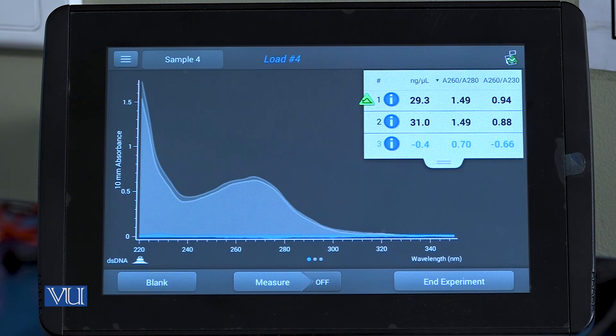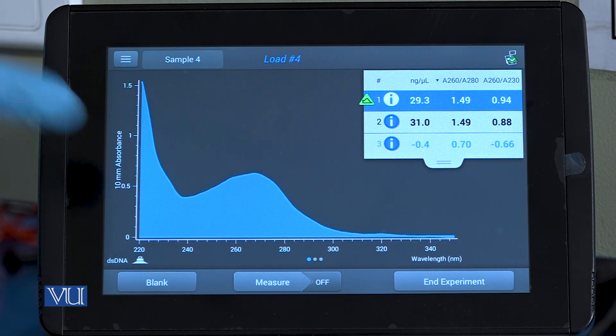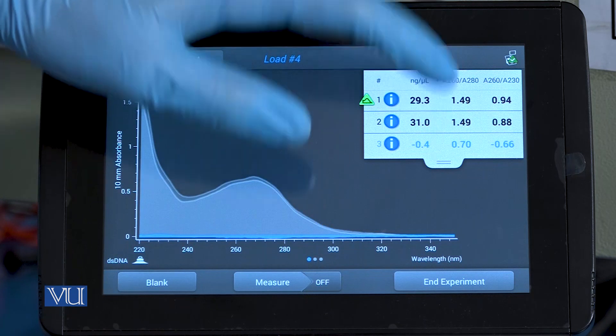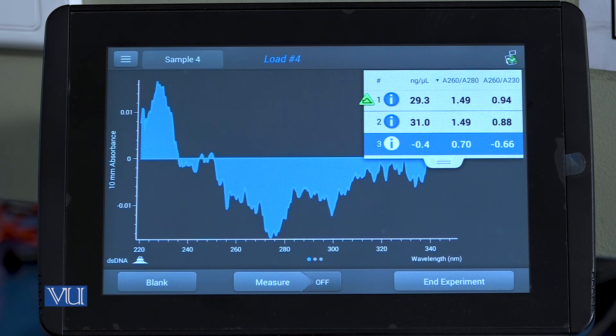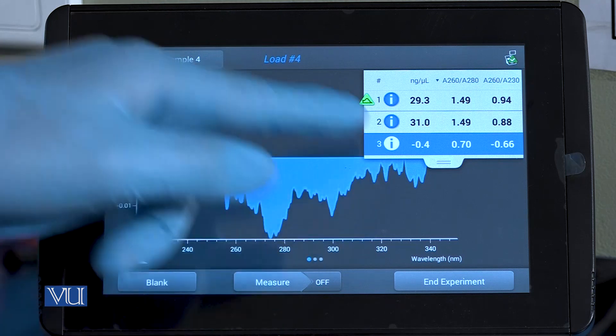In this case, you can see the values on the NanoDrop instrument. We can clearly see the difference between the peaks of these three samples. In the first sample, there is a sharp peak at 260 nanometers. While in the third sample, there is no peak present, which clearly confirms that DNA is not present in the third sample. So we will not proceed with the third sample for downstream application.